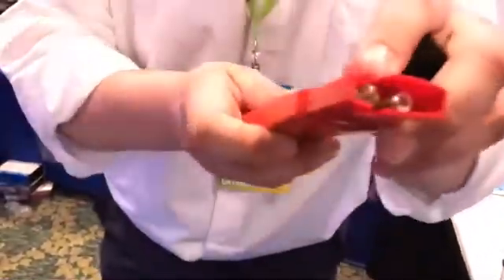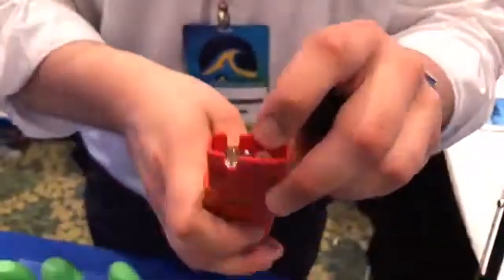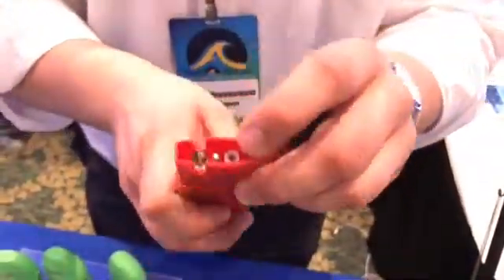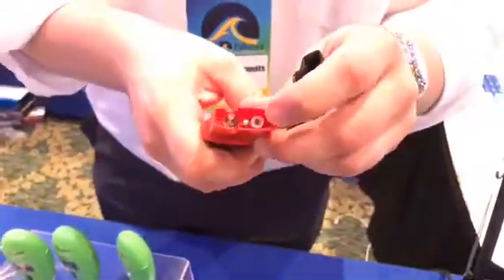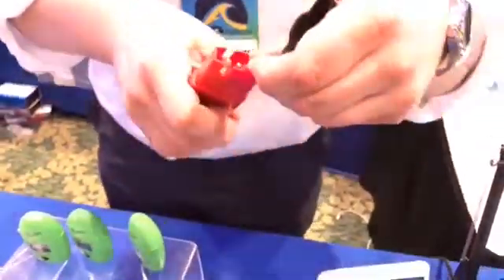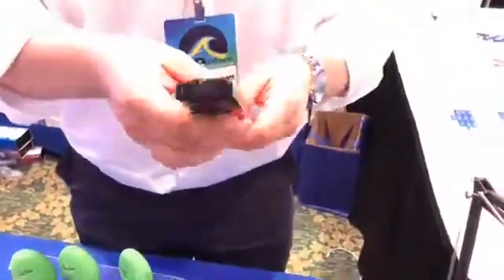Here you got your glass sensing bulb right there. That's going to be your pH electrode. You got your metal temperature probe there, and this is your reference junction. It has an extendable cloth reference junction, so anytime you're getting stability issues with your reading, you can just take a pair of tweezers and pull that out a little bit, and that's going to help get a more stable pH reading. That's pretty much the main ones.